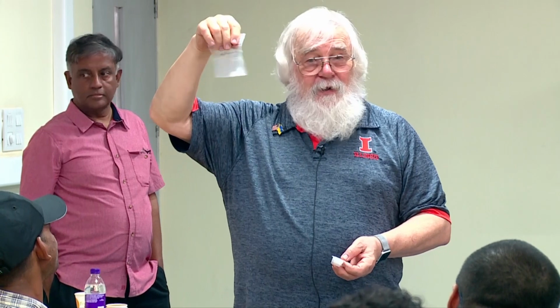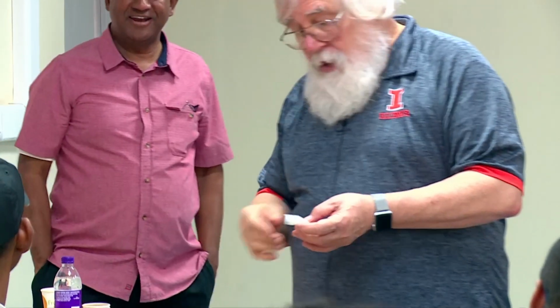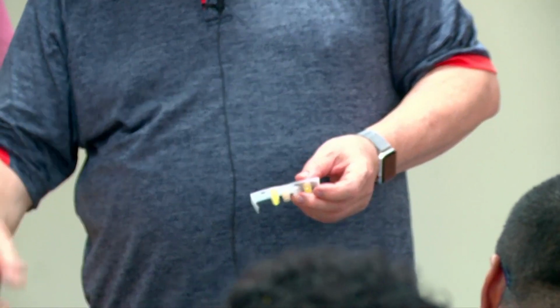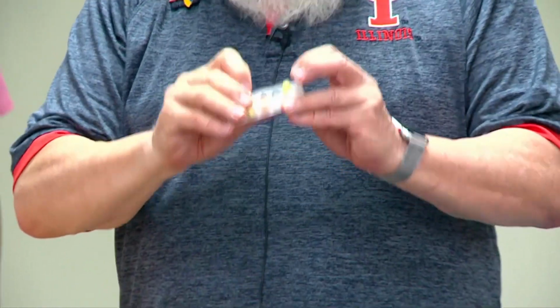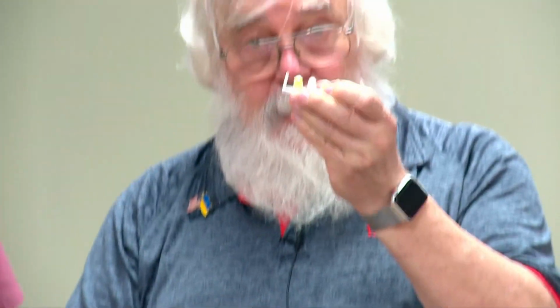Now, how do you prepare a sample of this to put in the electron microscope? If you just put this in, you're never going to see through it. What you need is a thin film, right? So what he's done is he's taken a small piece of the polymer with the silica in it, embedded it in an epoxy. We're going to then take that epoxy and put it in a device called a microtome, which is basically an ultra-sharp knife, and make thin slices of it. We'll then float that on top of a copper grid and try to put it in.